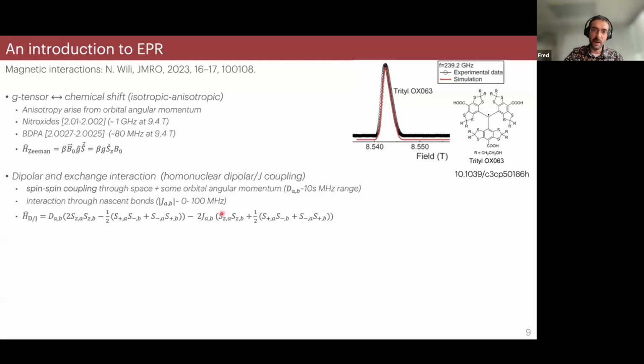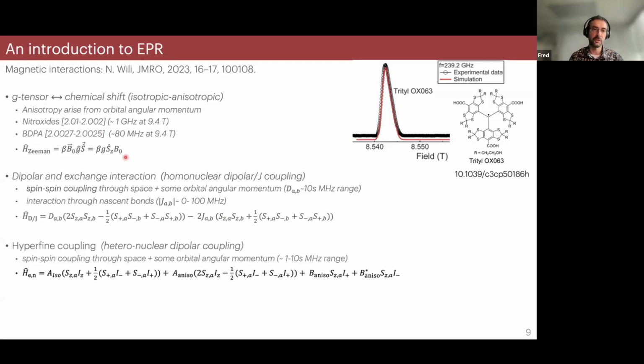And these would be the relevant Hamiltonians, I forgot to say, for these interactions. And finally, the most important one for DNP, in my opinion, is the hyperfine coupling, because this is the one that allows the talking between the electron spin and the nuclear spins. And in particular, one critical term is what we call the pseudo-secular term, where basically the quantization axis of the nuclear spin is slightly tilted by the presence of an anisotropic hyperfine coupling.